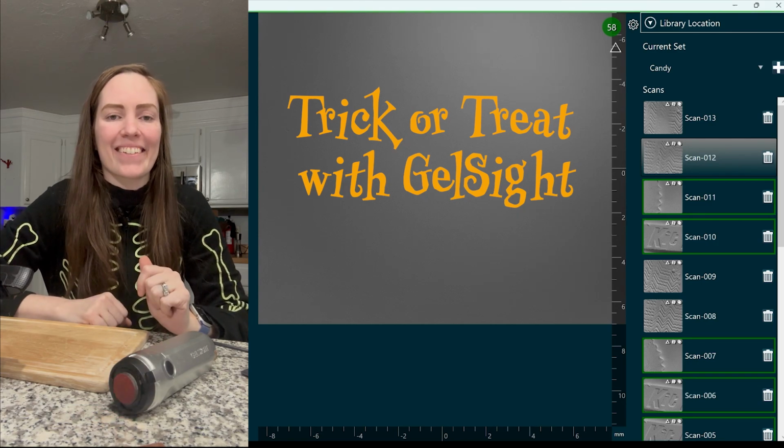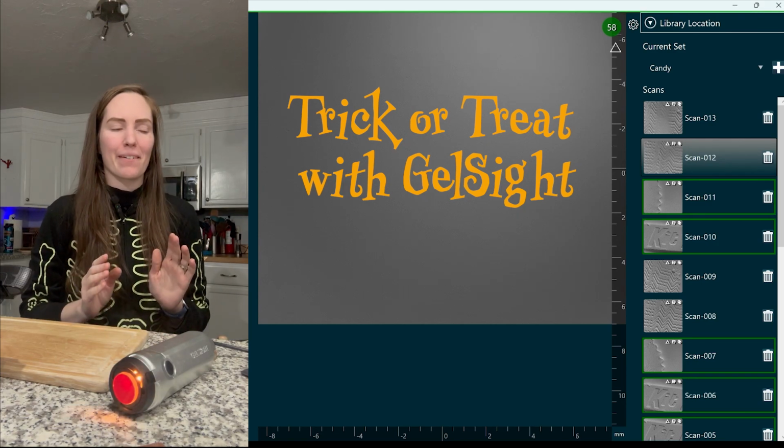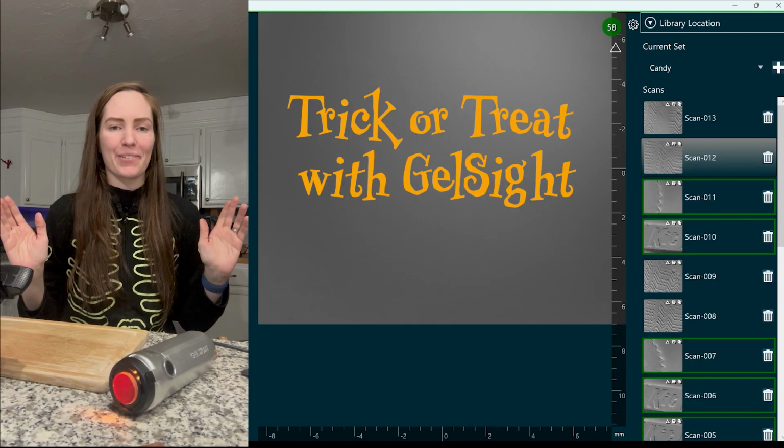I'm Abby Lindbergh. I lead GelSight's applications engineering team, and with Halloween coming up, I thought we'd take a look at some favorite Halloween candies.